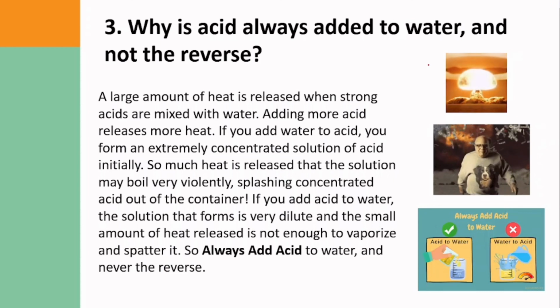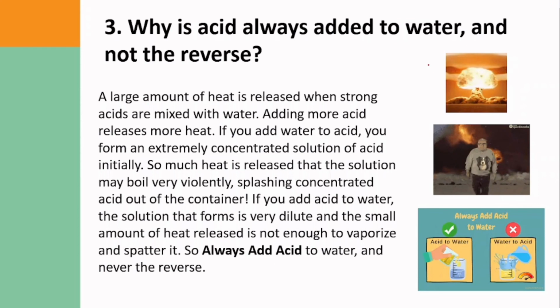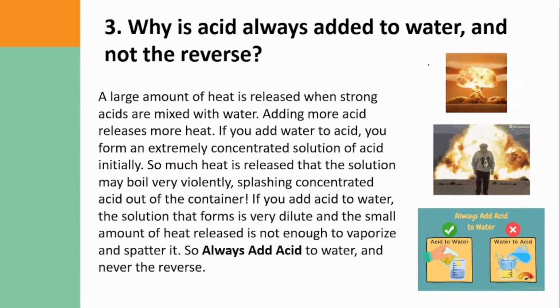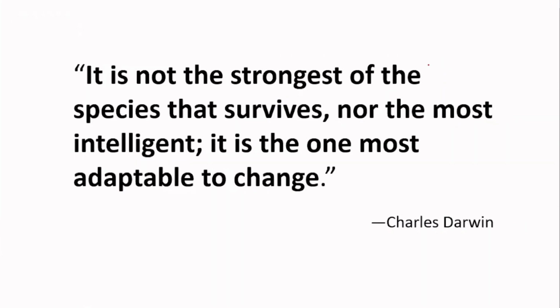Okay? So, our reminder for that is, it's like you are from the UK, like you are British, acid to water. Okay? Acid to water, always acid to water, and never the reverse. So, that's basically our discussion for your post-lab discussion.